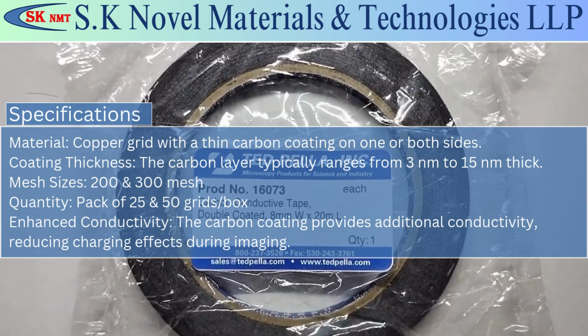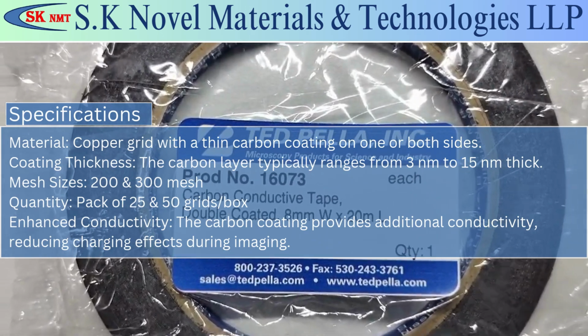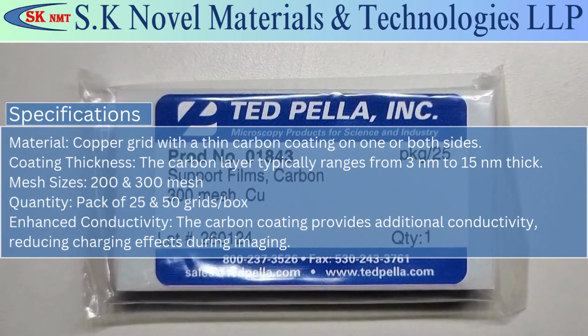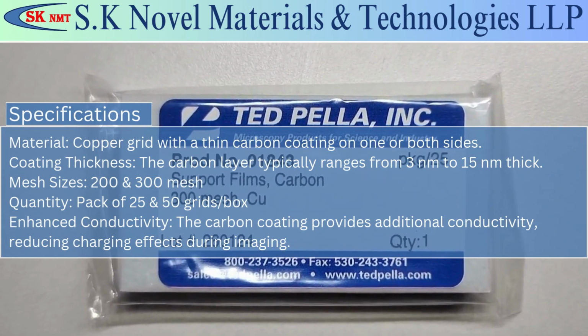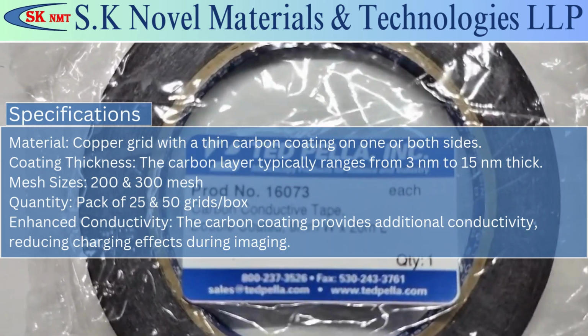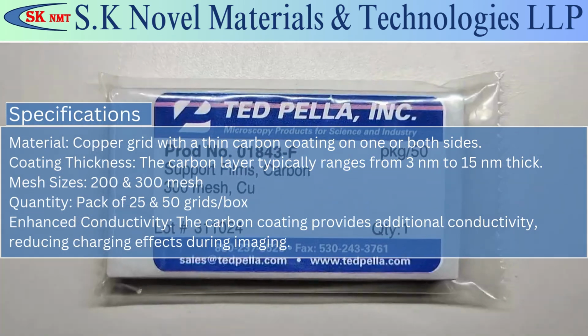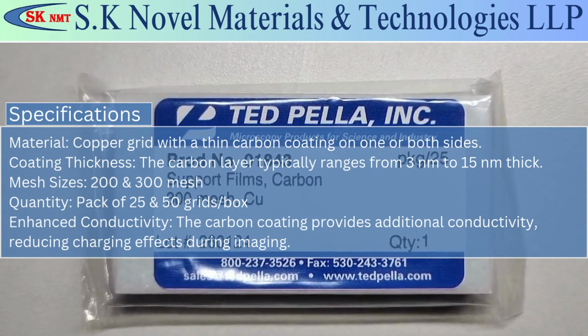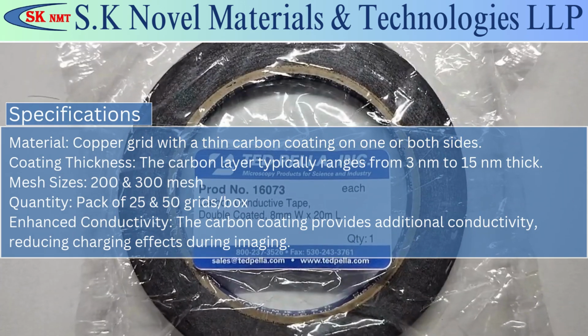Coating thickness: the carbon layer typically ranges from 3 nanometers to 15 nanometers thick. Mesh sizes: 200 and 300 mesh. Quantity: pack of 25 and 50 grids, box. Enhanced conductivity: the carbon coating provides additional conductivity, reducing charging effects during imaging.